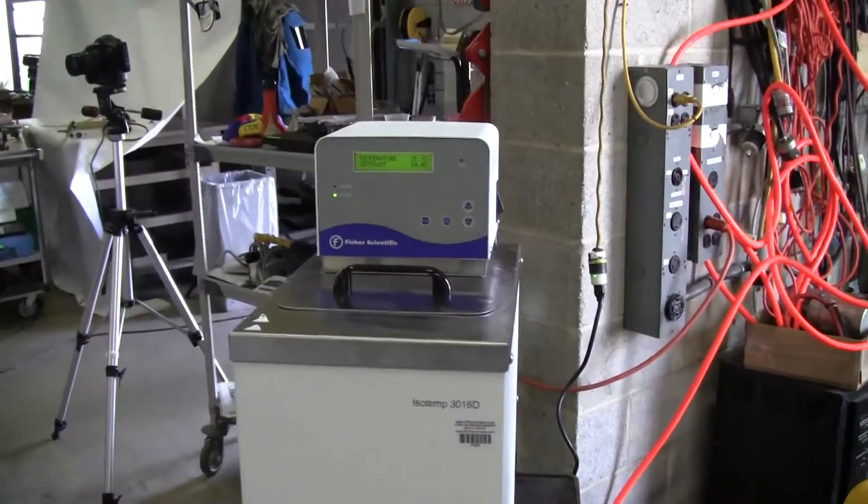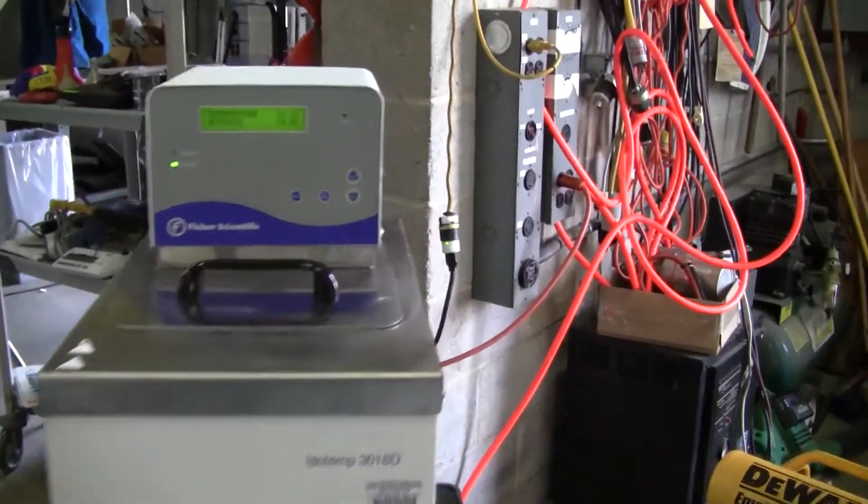It's got a temperature range of minus 20 to 200°C. It's got a 6 liter capacity.